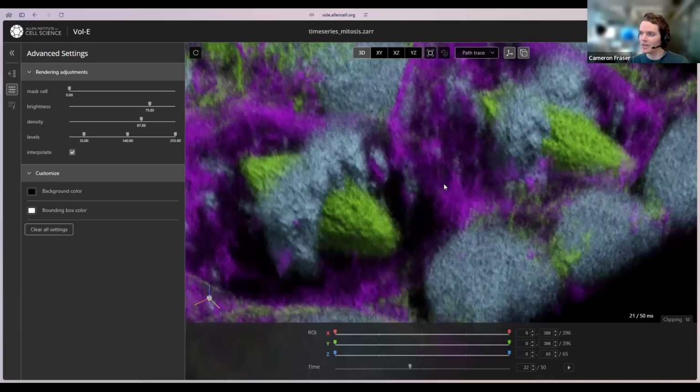This is kind of a miniature version of the rendering technique that AGAVE is really committed to specifically. You'll learn about AGAVE much later in this talk from Dan. You can kind of see in this render that, for instance, we're getting some shadows here where there's a cranny between these microtubules and this bundle of DNA.